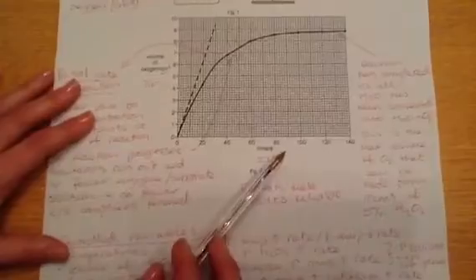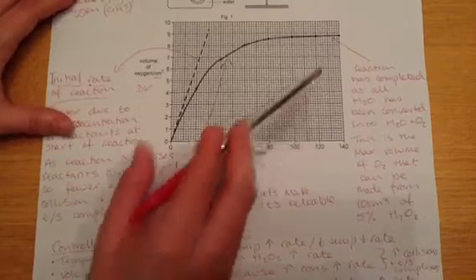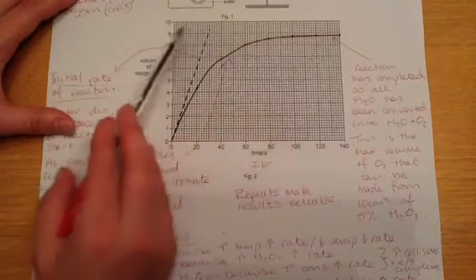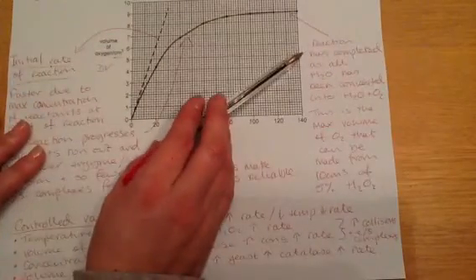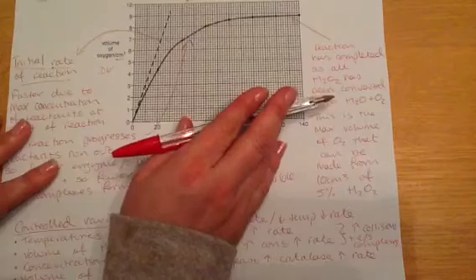Now there comes a certain point, around from 100 to 120 seconds, where we see this plateau. It doesn't matter how much time progresses from here, the volume of oxygen that we collect never gets any higher. So this is where we've reached our completion point. All the H2O2, all of the hydrogen peroxide, has been converted into water and oxygen.